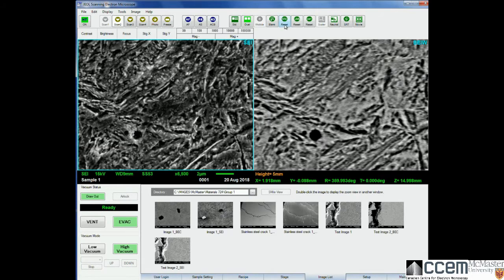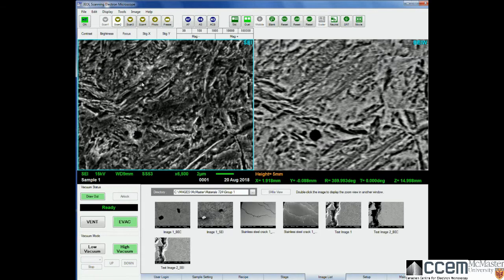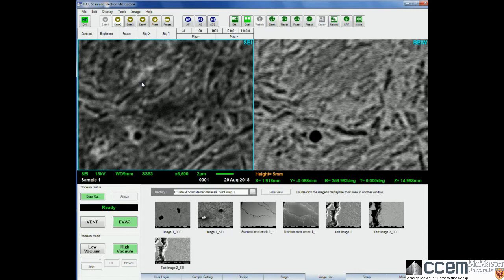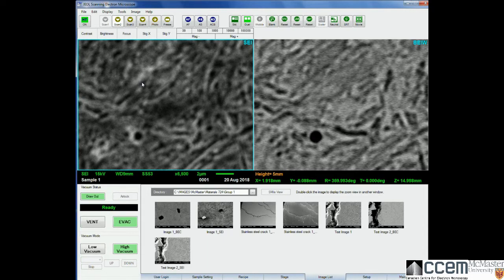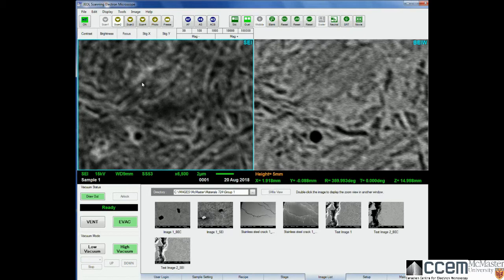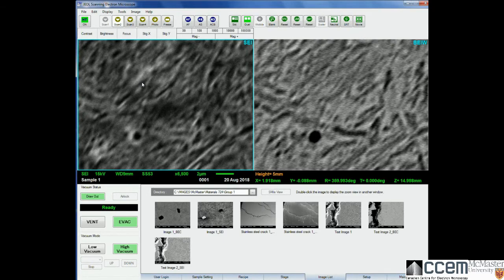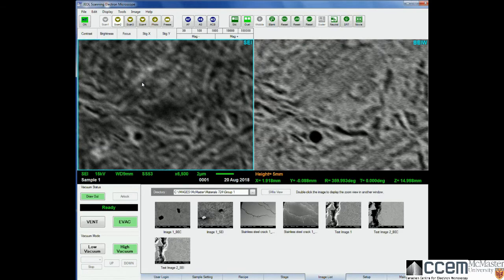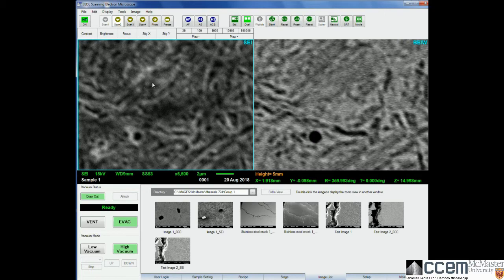You'll also see that there are some other controls we can do here. For instance, we can reset the stigmation back to zero if we run into problems with adjusting the stigmation too much. So if we put the stigmation to a sort of blurry setting, we can reset it back to zero and you'll see it comes back.